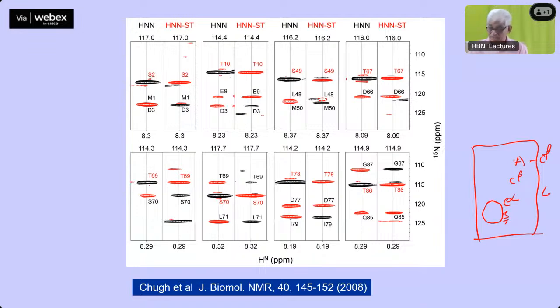So, just as we did the trick for alanine, where we applied the selective pulse only to the C-beta to decouple the C-alpha-beta, you now do the same thing for serine and threonine. You excite all of these and eliminate all of these ones. That means you convert everybody else into glycine except serines and threonines. When you apply a pulse here, the serine and threonine C-betas get the pulse, along with the C-alpha. But the pulse is not applied to the C-betas of everything else. That means everything else becomes like a glycine.